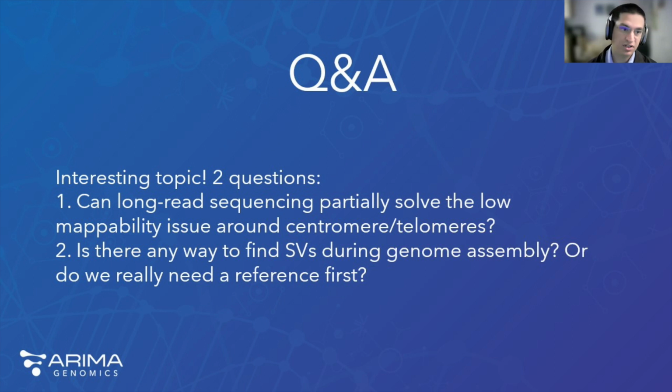You don't get the advantages of long read sequencing because you have damaged DNA and sample types. But if you have fresh samples, I think it can yield better research and better data by coupling two really useful and valuable technologies together to give you a better picture. And that's why in genome assembly projects, you typically do combine Hi-C data with long read sequencing data.